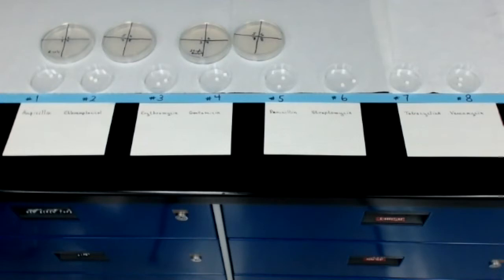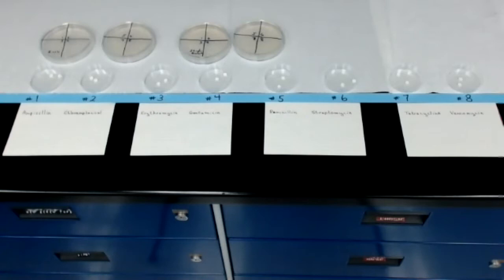Now, in Module 15, we talked about the fact that there are many antimicrobial agents, and that those antimicrobial agents can be broken down into two smaller groups: the chemical antimicrobial agents and the biological antimicrobial agents. Module 15 evaluated the effectiveness of several different chemical antimicrobial agents, also known as disinfectants and antiseptics, against two bacteria, E. coli and Staph aureus.